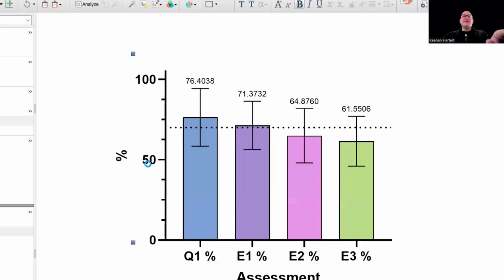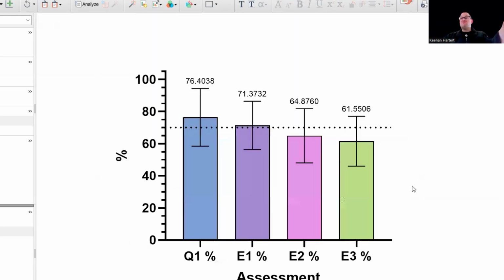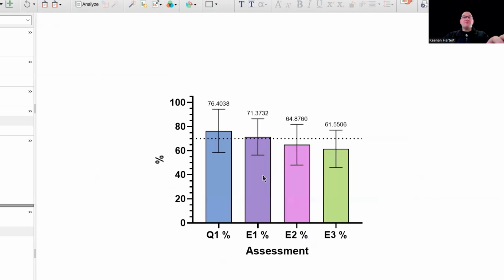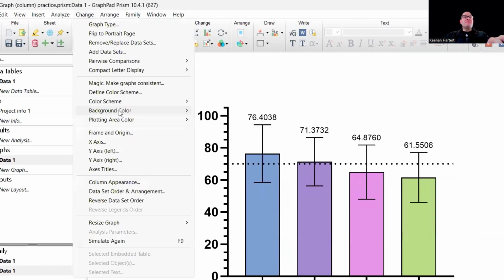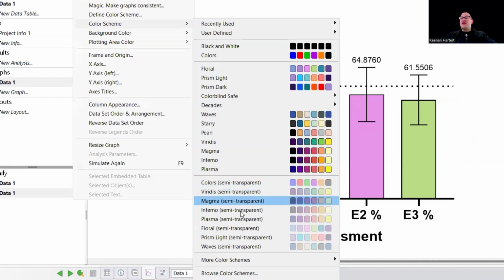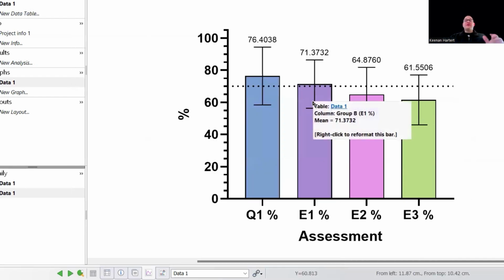Yep, and then it's going to fit. But it will automatically get my tick marks down here down to 50, which I don't like. I liked them at 20. So let's move them back like that. Really nice. Really good setup, really easy access. And again, like I said, you can use these color schemes in here perfectly. You can change them, move them, and then you can decide what else to change on your own.